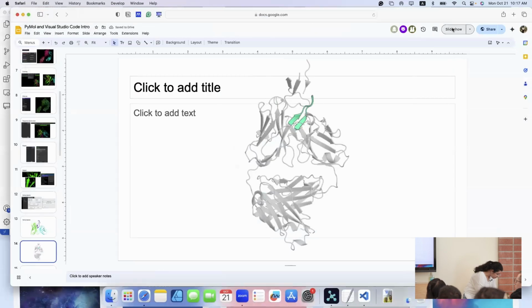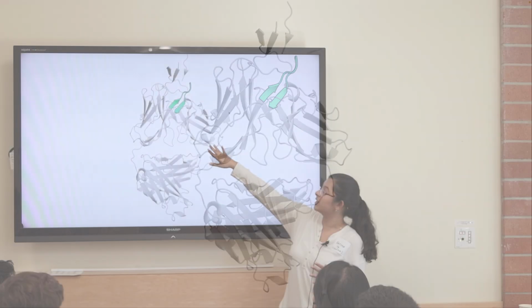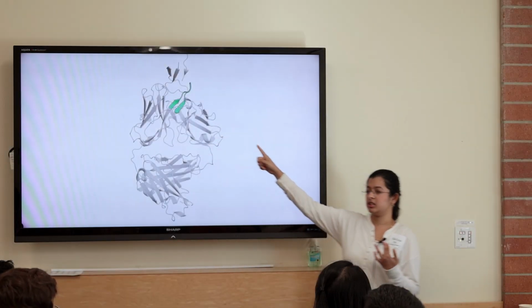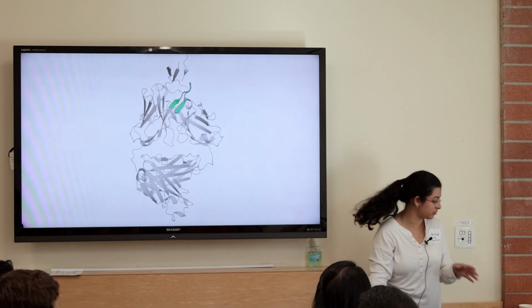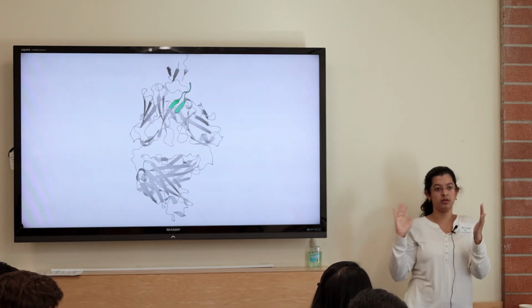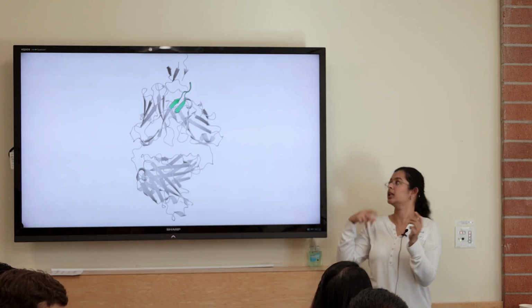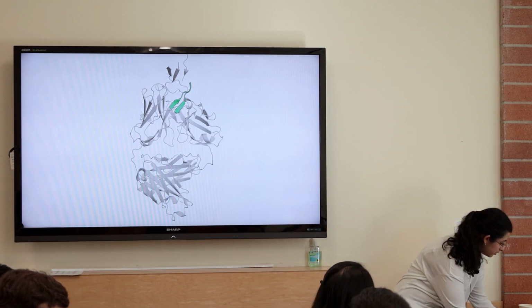You guys see that? Okay, so you see what I mean? Like the cartoon transparency, you can still see everything, but it's not highlighted. And then I just changed the color and set that transparency. It's popping out. So it's really, really easy to see. And that way, when you're aligning stuff, a lot of times you want to see, okay, if 3 things are similar, there's a little bit of a change. How do you go about doing that? This is a really effective way to show that off.